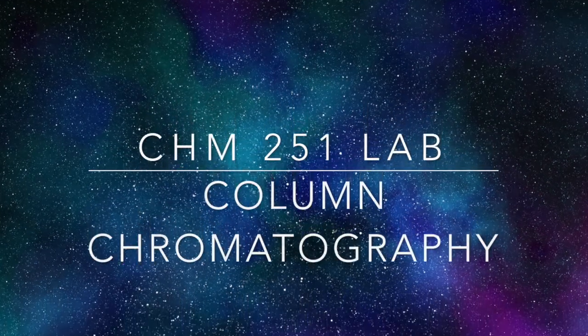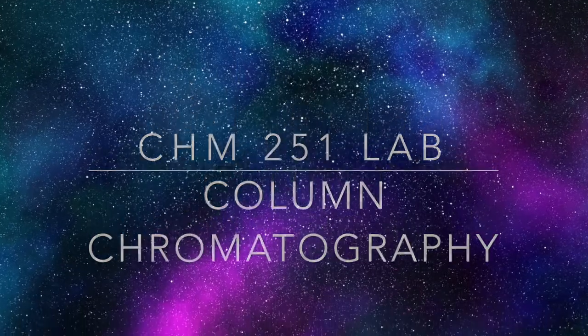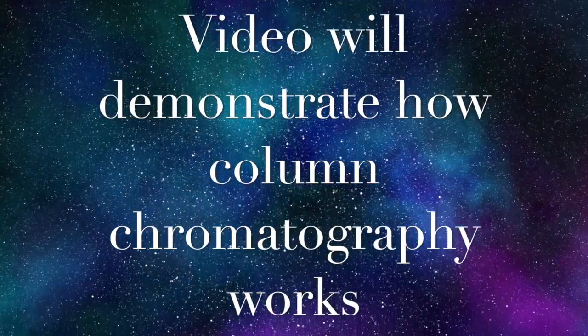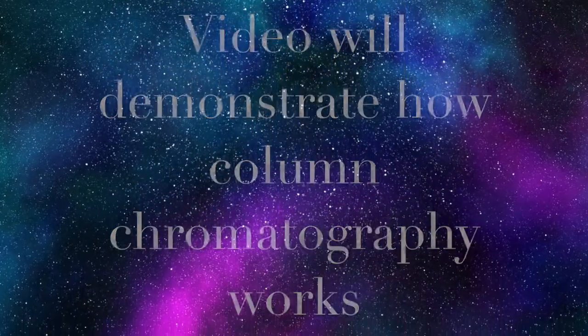Today we're going to do a column chromatography experiment. I'm going to do this mainly as a demo, not really collecting and measuring things, but just to give you an idea of how column chromatography is carried out.